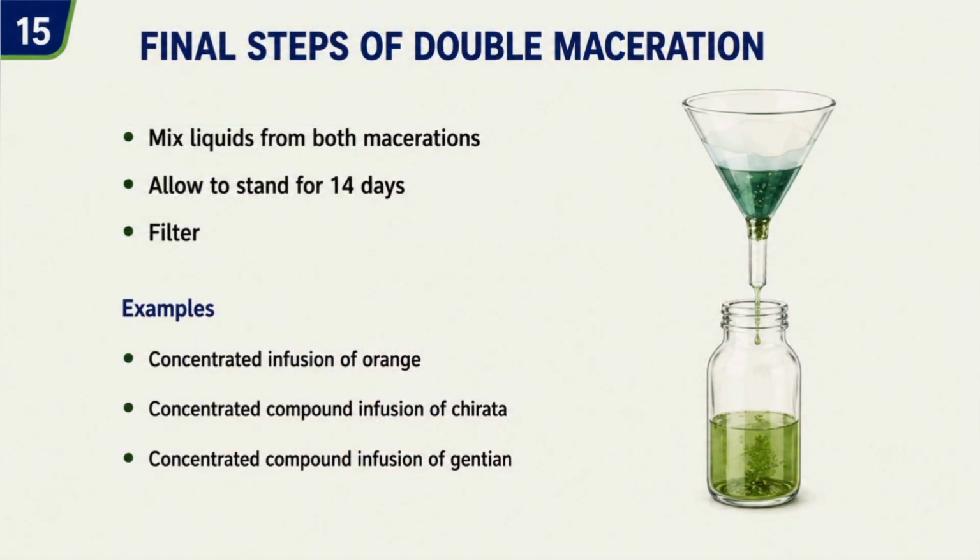Final steps of double maceration. After both macerations, the liquids are mixed. The combined liquid is allowed to stand for about 14 days and then filtered. Examples include concentrated infusion preparations. The important idea is that the separate extraction stages are finally combined.